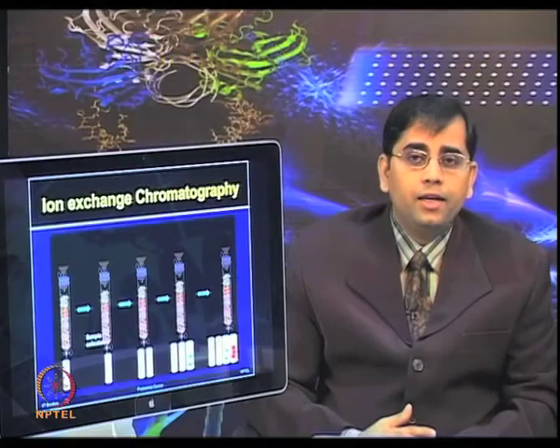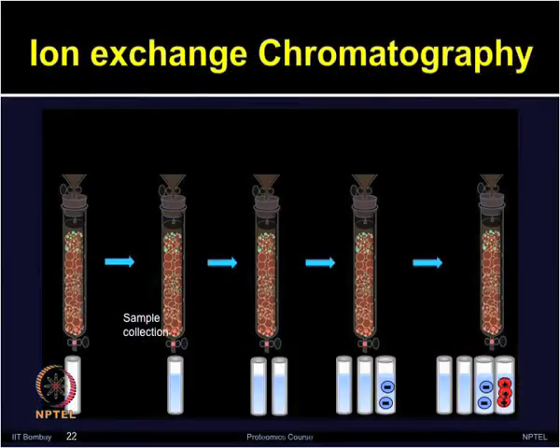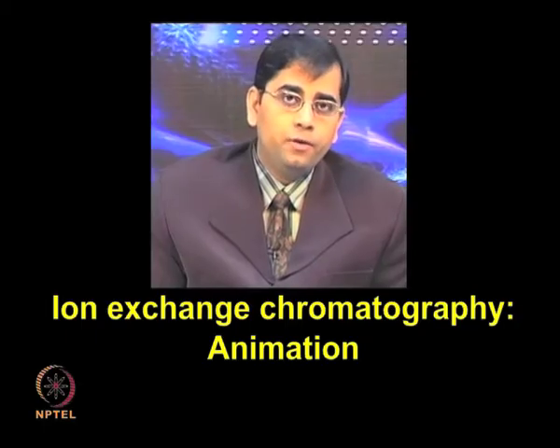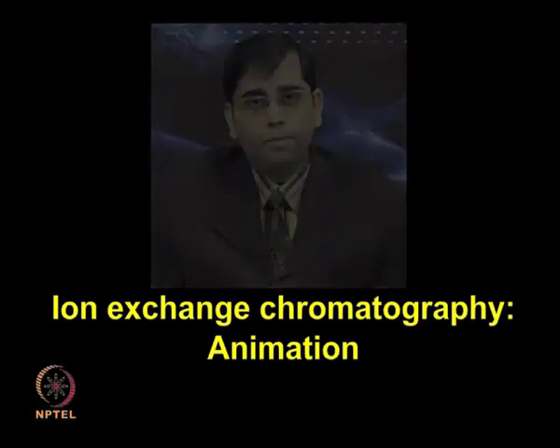So, if you have a negatively charged protein, it gets eluted first and will be present in the initial fractions, while the positively charged protein that is bound to the column will be eluted in the later fractions, or it will be vice versa. Let me describe how ion exchange chromatography works step by step in the following animation.